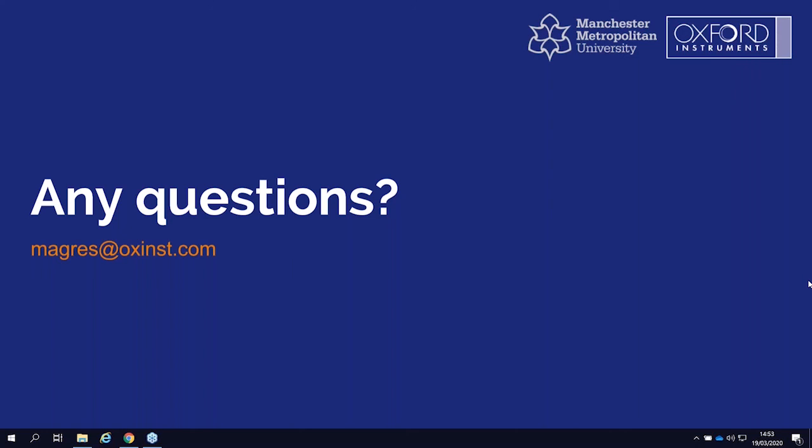Well, that leads us very nicely to one of a few questions from Chris Thompson. Now, Chris, clearly you're very engaged in this. It's obviously something you've got a bit of experience with already. That email on the screen will probably be able to provide you answers to all of your questions. But the one that is particularly relevant right now is Chris has asked how secure the connections are in your flow cell. So can it be used under back pressure? And if so, what sort of pressures are we looking at?